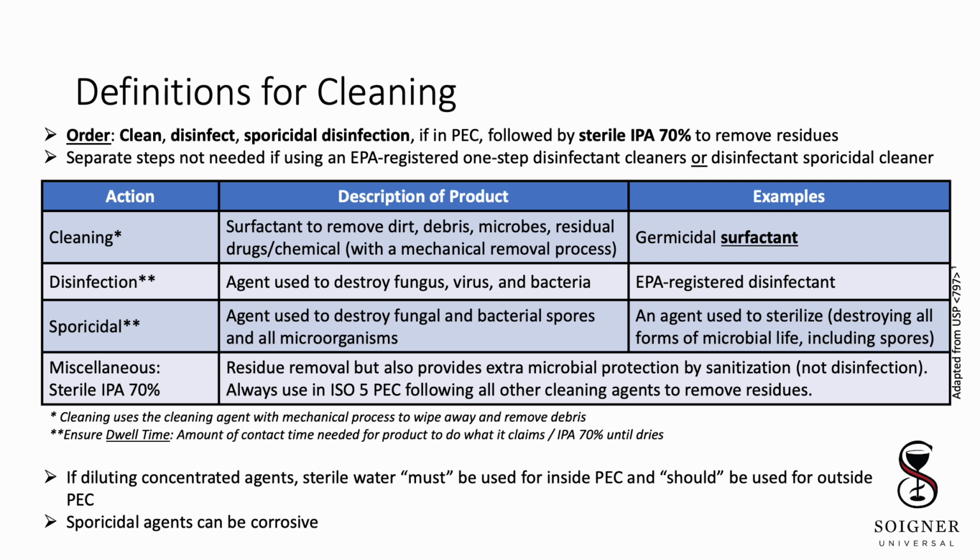So that leaves us with sterile IPA, or isopropyl alcohol. Although never really the intent, many may remember that IPA used to be the one and only product that we ever used to clean IV rooms. Although sterile IPA 70% does have broad spectrum activity against microbes, it's not effective for all microbes and does nothing for spores. Spores can actually live in IPA.